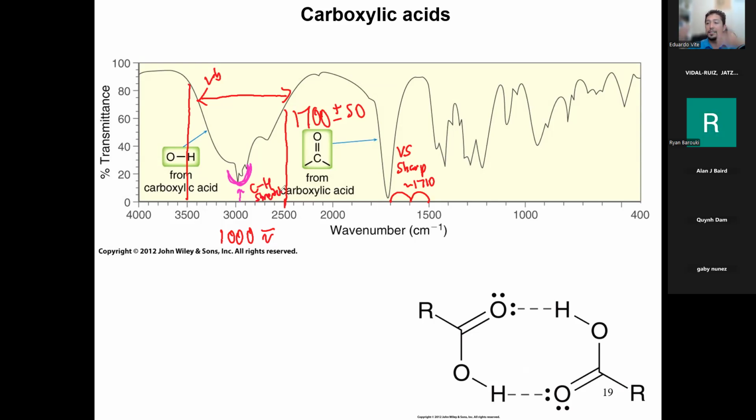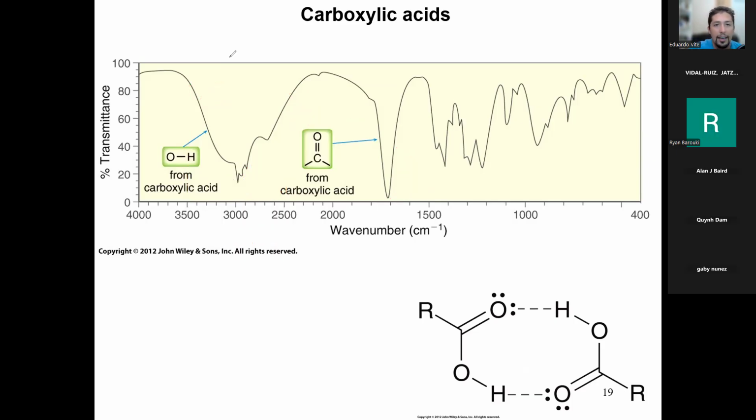You'll notice that the signal of the OH, the hydroxyl in the carboxylic acid, is so broad that it swallows up the stalactite signal. You only see the very bottom. We call the whole thing a beard, like a wizard's beard. I can draw the eyes up here, a smiling face, and a little wizard's hat over here, which looks more like Santa Claus.